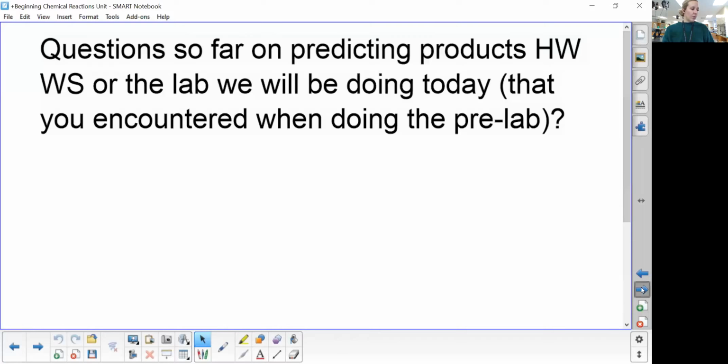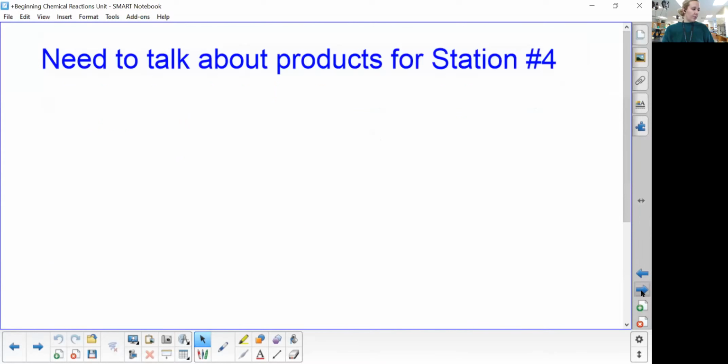Again, some of the lab, in order to determine what state of matter the products were after you predict them, is using your observations, okay? As well as the rules and stuff that I've taught you, but you can predict a lot with your observations as well for this, rather than just your guide to chemical reactions, which is designed to help you. So one of the stations though that has a nuance that your guide will not be able to help you with is station 4.